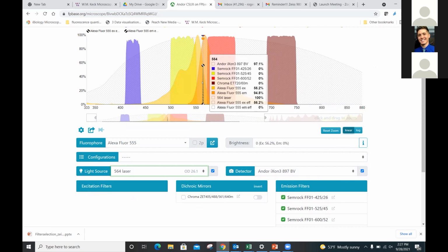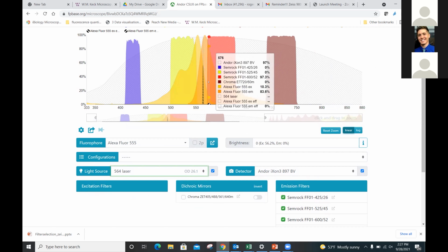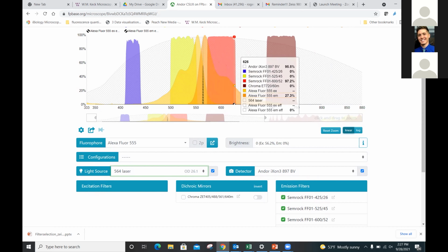And so when we're talking about setting up our filters properly and choosing fluorophores carefully, this is really what we're talking about. It's all about knowing the microscope that you're using and knowing its spectral characteristics. And again, with the 980, at least for the confocal, it's really the excitation wavelengths that are fixed.